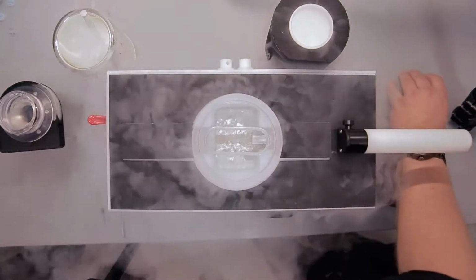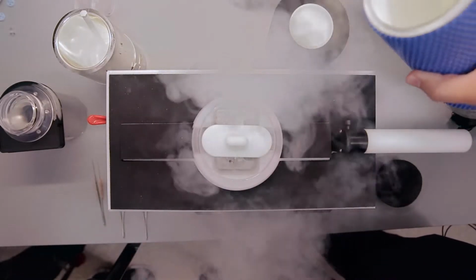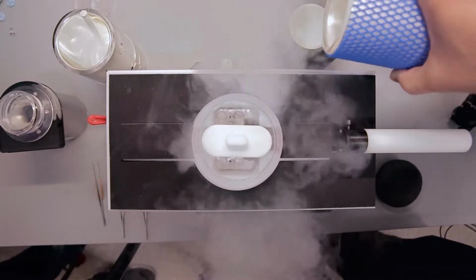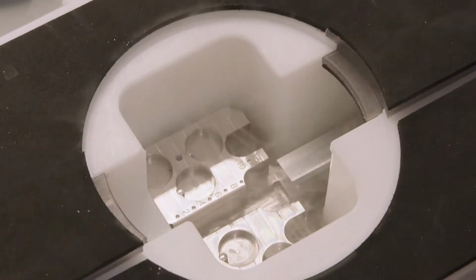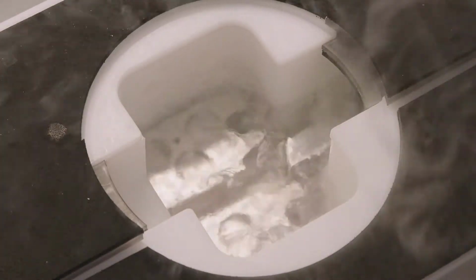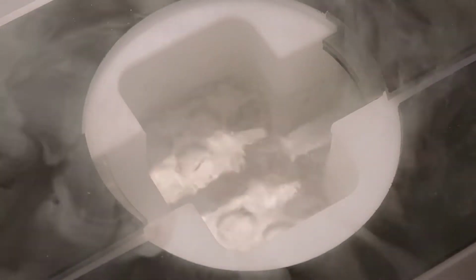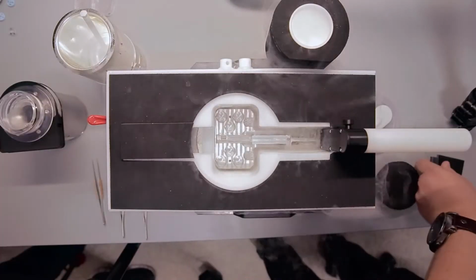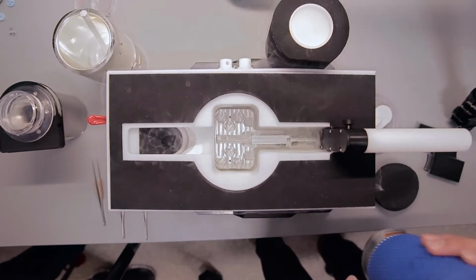Of course, while you're further along with cooling, you can also put that lid on top there and pour through this part over here. Be aware that nitrogen itself is clean and also nitrogen vapor is clean. You may spill quite a bit of liquid nitrogen, but that actually drives out all the water vapor. So if you're fast, you could also decide to not use these covers and just fill it quickly with a lot of liquid nitrogen and load your samples fast.